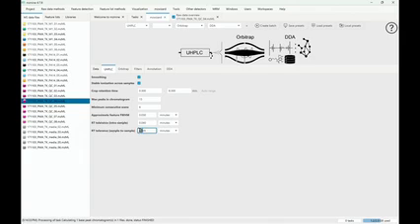For the first run, you could just increase this number, and then mzmine is going to tell you if there was a good alignment and what the maximum retention time difference was for your compounds. For now, we can just leave it at 0.1.